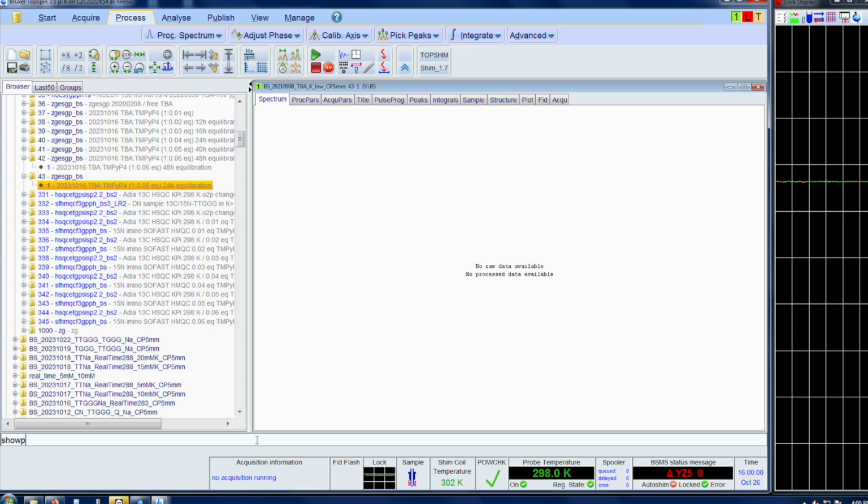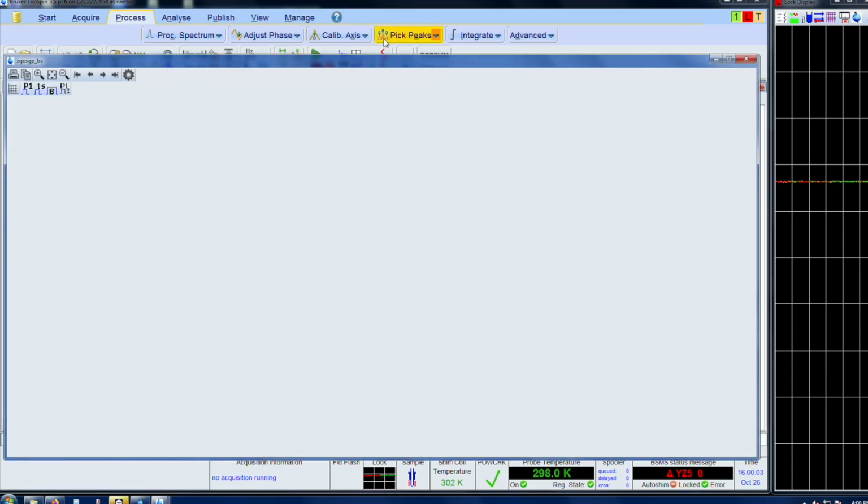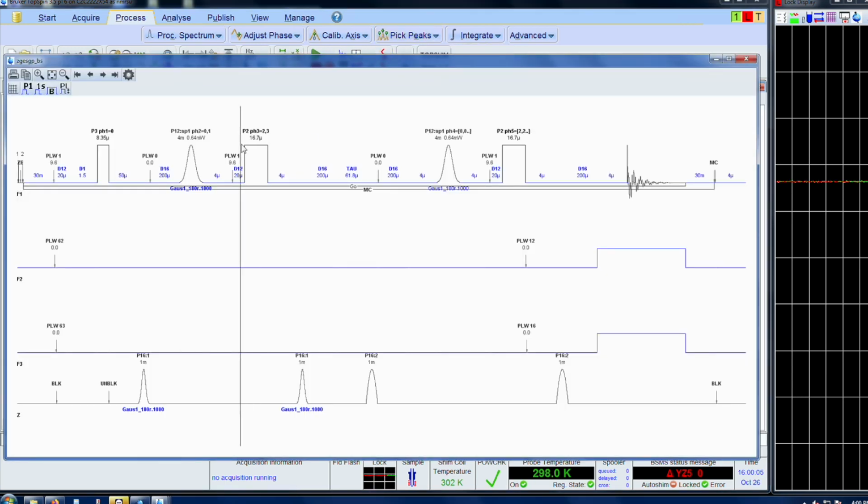The experiment that I'll be running is something called excitation sculpting. Basically, you have the 90-degree pulse followed by a selective 180 on water and a hard 180 juxtaposed with gradients of similar kind. Since I have not dealt with this in the class, I cannot end up discussing what's happening here. But it suffices to say, after the 90-degree pulse, all that we are trying to do is to suppress the water signal in order to make sure you have minimum water, as your sample is at 1 millimolar while water is at 110 molar, and therefore acquire the signal that is coming.